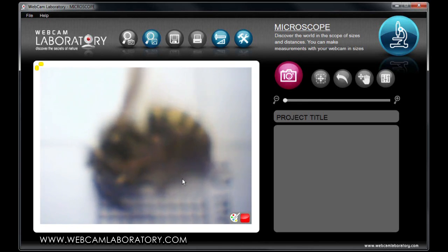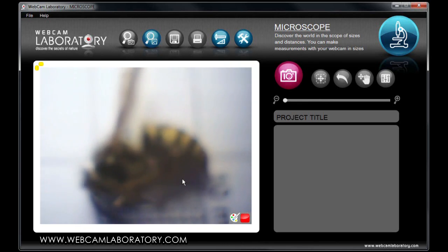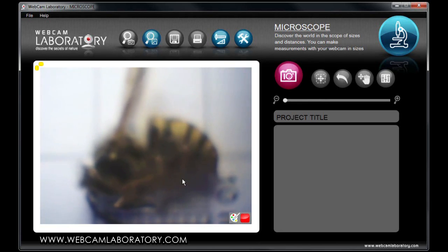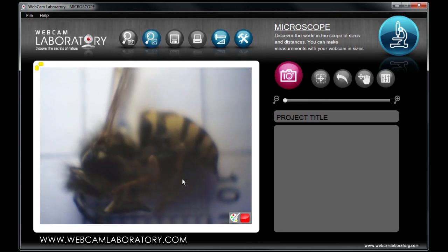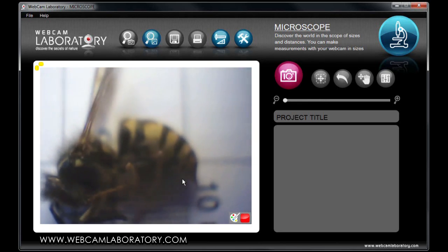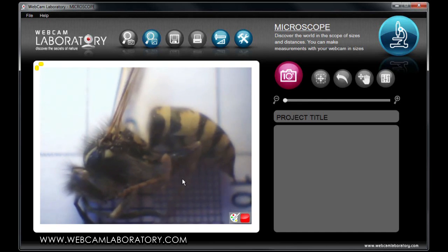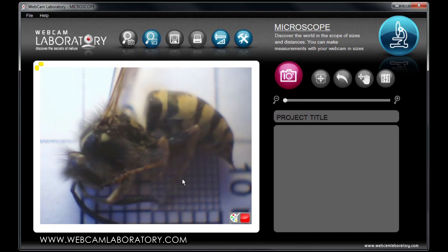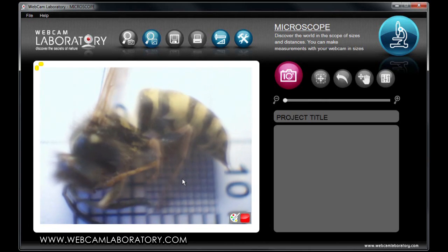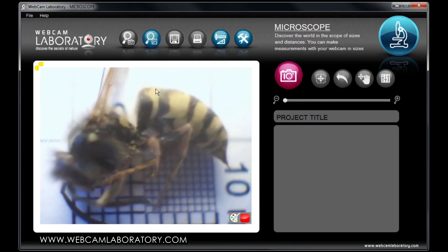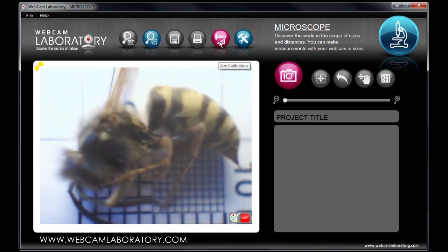Webcam Laboratory comes with a scale sheet. If you print it in its original size, you can place it underneath the object you are examining. Once the picture is adjusted for sharpness, you have two choices: either use the size calibration or the start recording button.